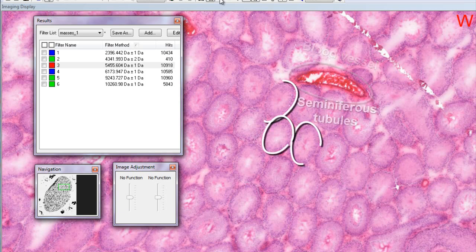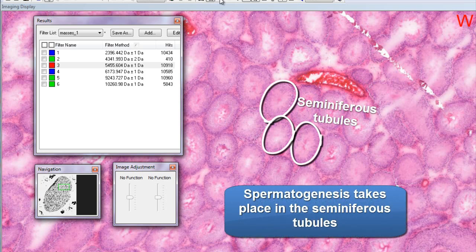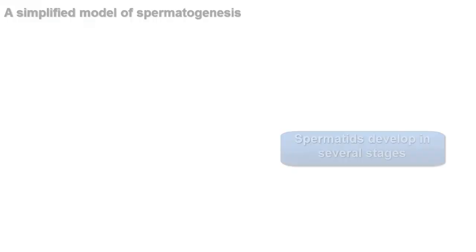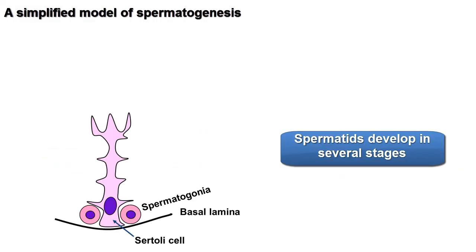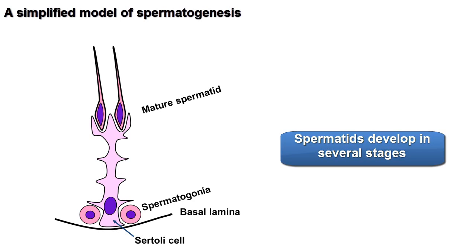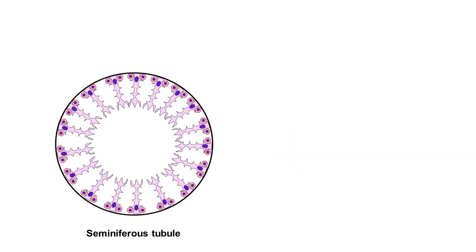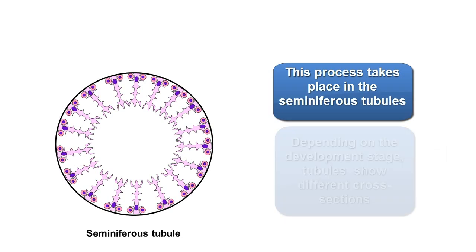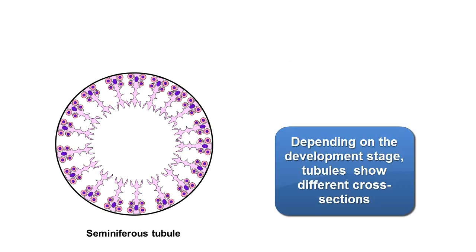Looking at the anatomical features, we can identify blood vessels and seminiferous tubules. The process of spermatogenesis takes place in the seminiferous tubules. Spermatids develop in stages, and this process takes place in the seminiferous tubules. Depending on the stage of development, different tubules will show different cross-sections.